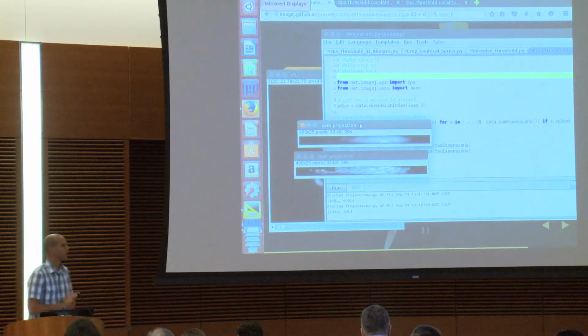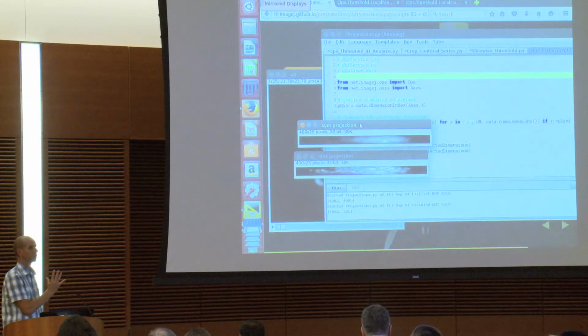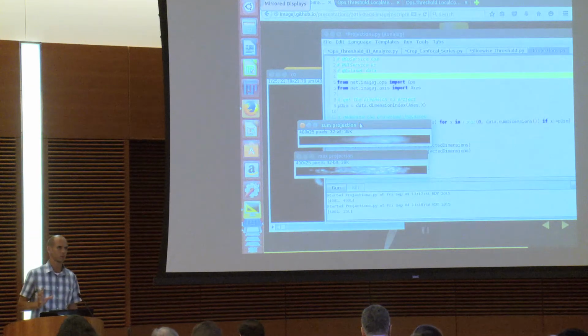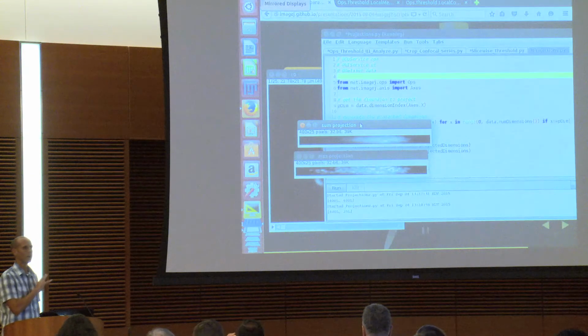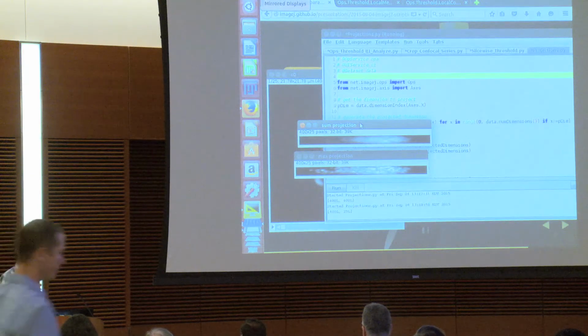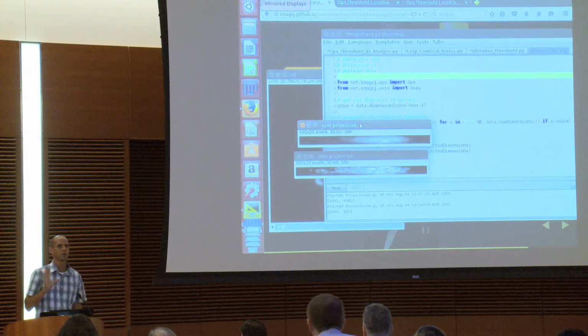So another thing I'll say about this script, I realize that there are a lot of steps to just get a projection. This is something that will change in the near future. We were already talking about this a little bit. You really should just be able to say ops.project and pass in your data set and your dimension, and boom, you get it right away in one line of code. And that's going to happen.